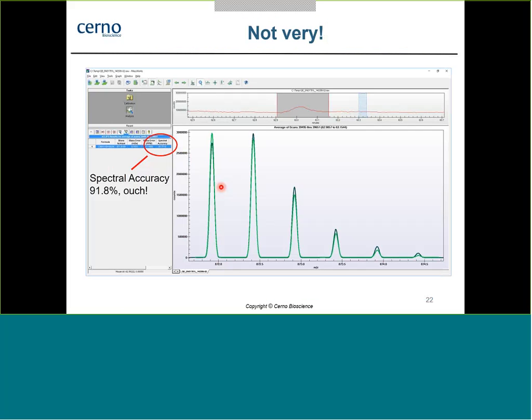So we perform that analysis, and there's the peak at 63 that we're analyzing. What you see here in the green line is the calculated or true mass spec based upon principles. And the black line here, which you see doesn't actually match up very well, is the calibrated mass spec.